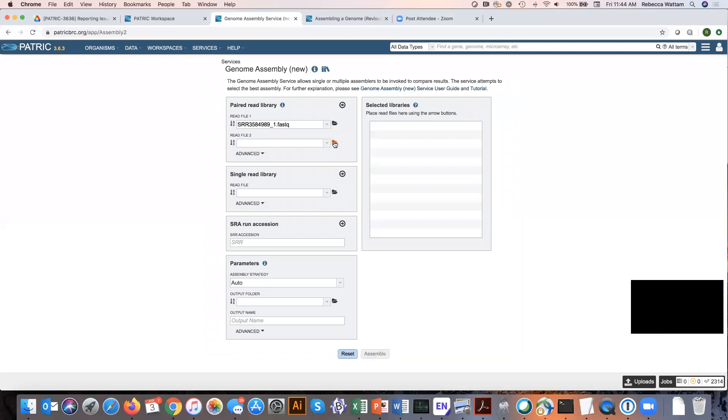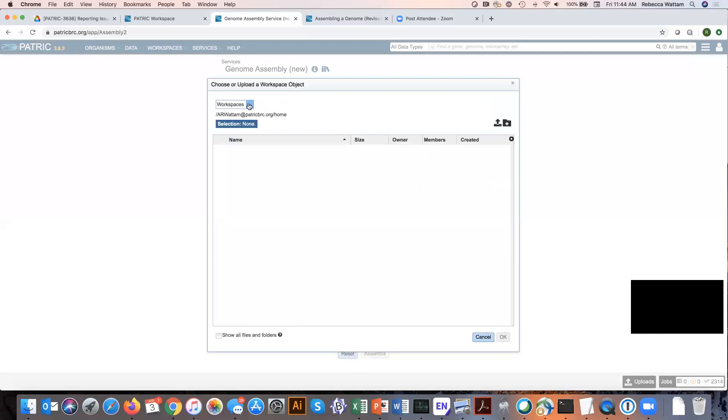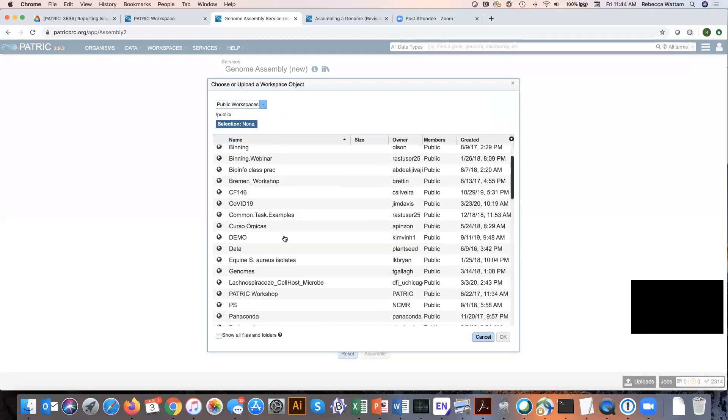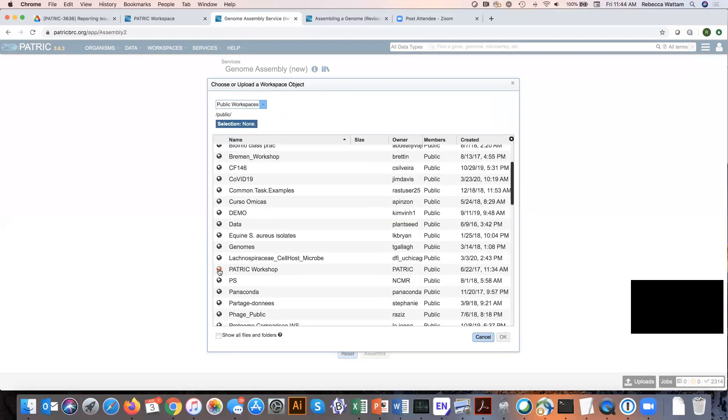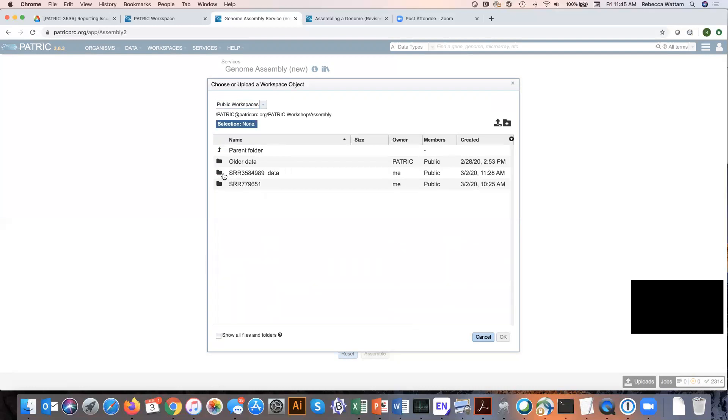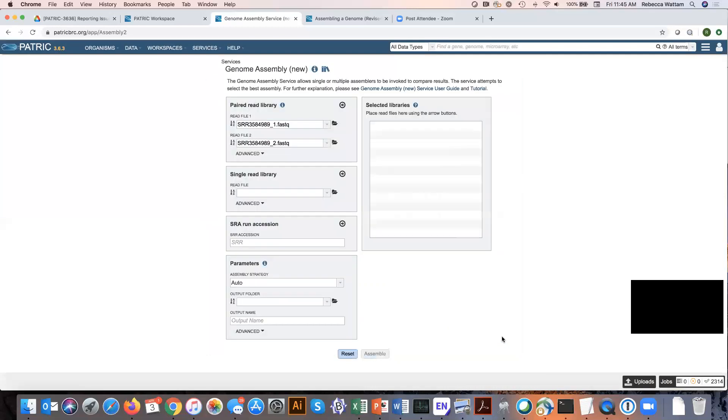Now we need to get the mate to it. Click on the folder icon, then workspaces, then public workspace. Scroll down until you see Patrick Workshop, click on the globe, click on the assembly folder, click on the SRR 3584989 underscore data folder, and click on the second pair of that paired end. Click OK.